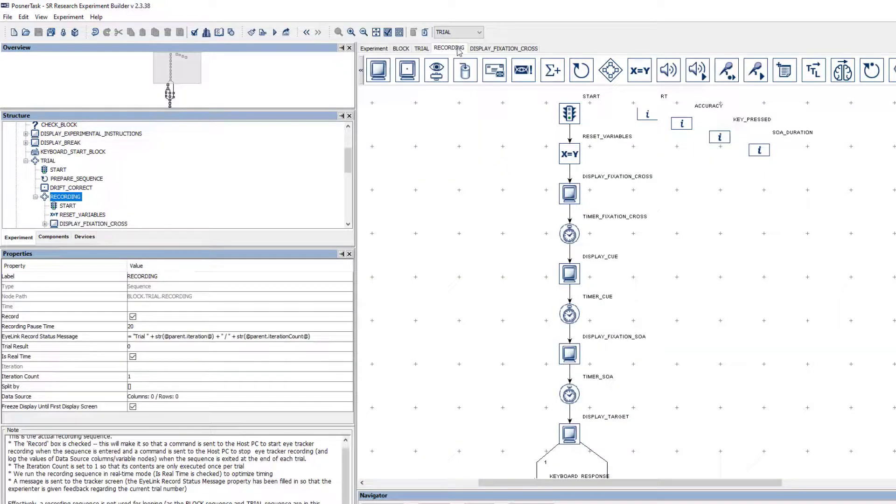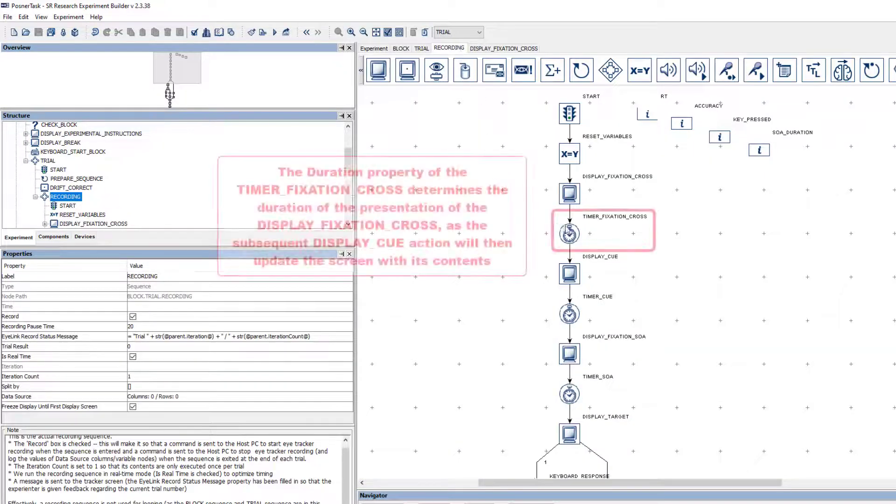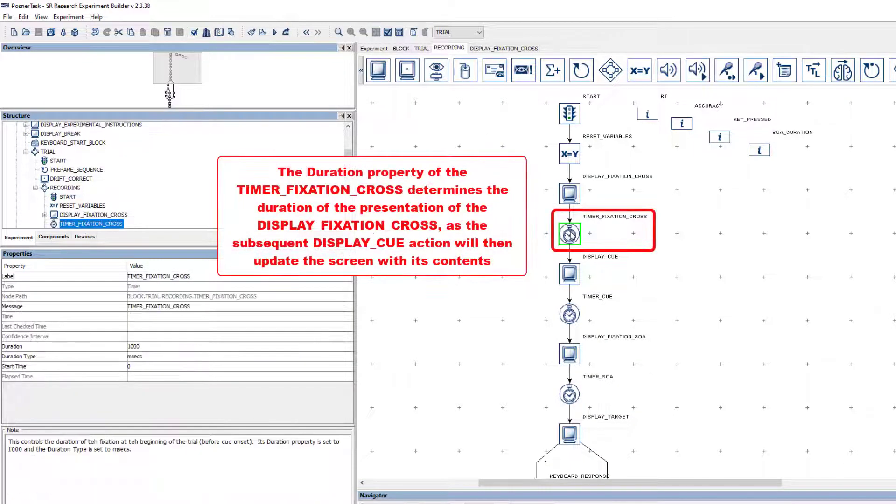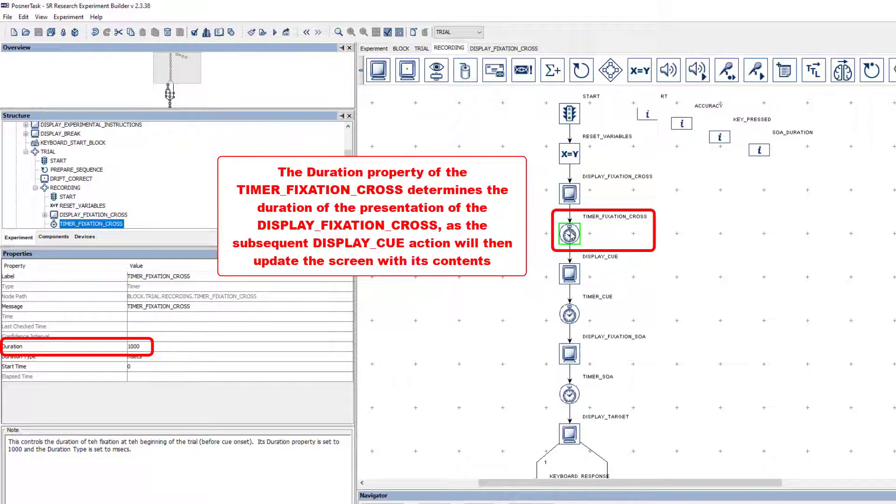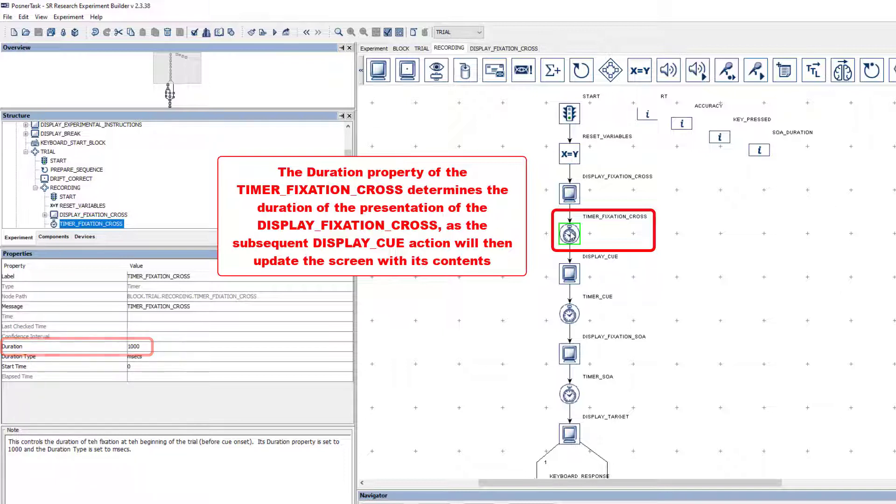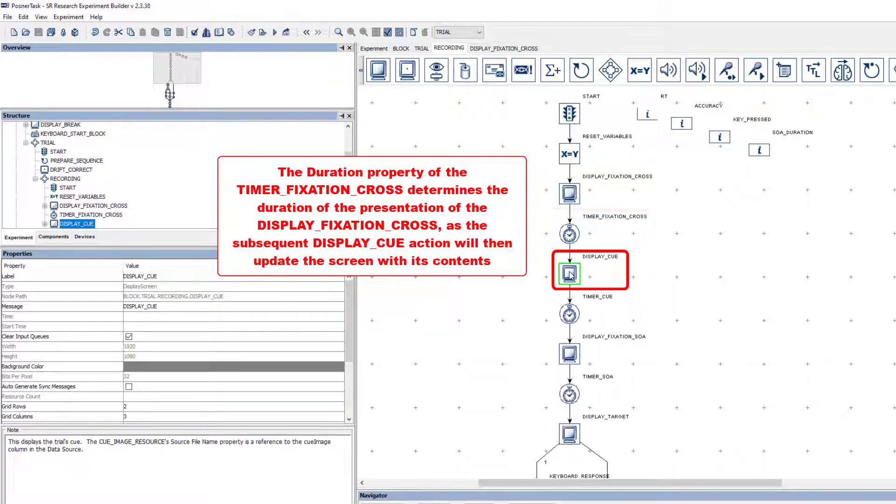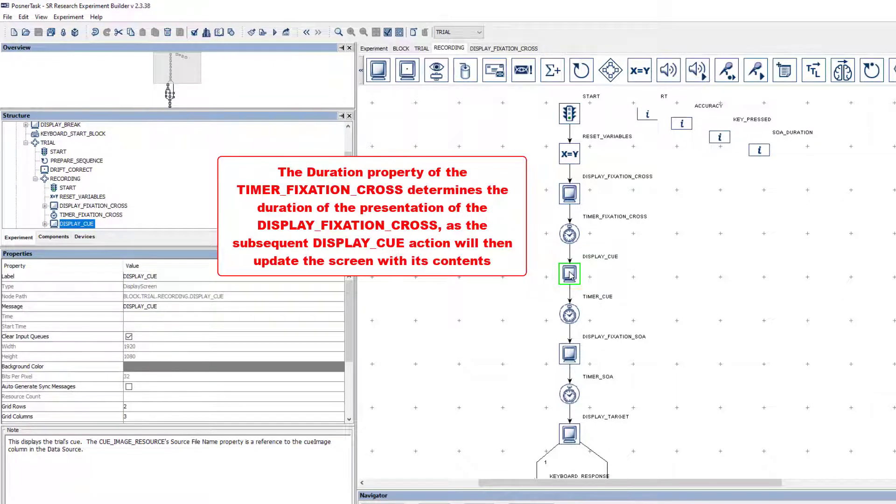The contents of the Display Fixation Cross action will remain on the screen until the Timer Fixation Cross trigger fires. You can see from its Duration property that this will happen after a thousand milliseconds, and it is this property that you would edit if you wanted to use a different duration. This duration will be the same on every trial, as the Duration property is set to the static value of one thousand. Since this Timer Trigger is connected to a subsequent Display Screen action, which will change the screen to reflect its contents, it will control the duration of the Fixation Cross presentation.